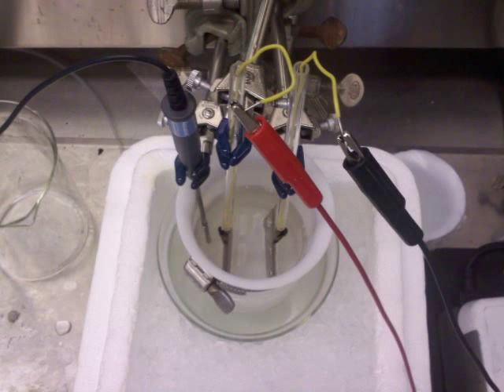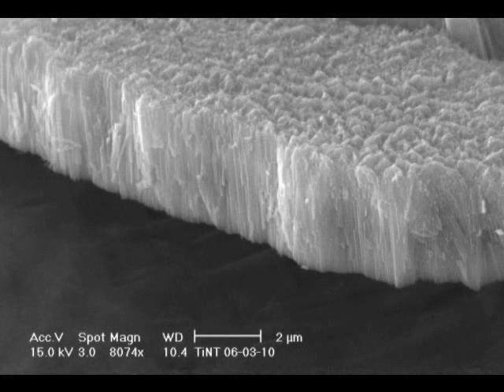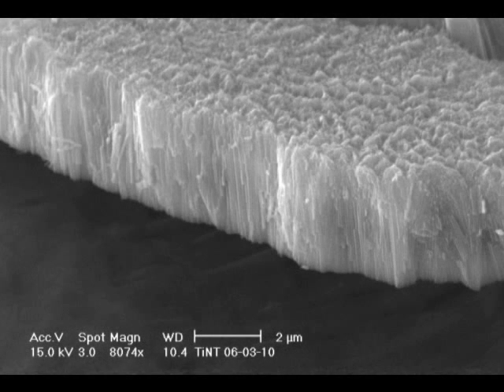The first step in making our anode is a process known as anodization. An electrolyzed solution is used to etch nanotubes into a titanium plate, forming titanium oxide tubes with a width in the range of 40 to 200 nanometers depending on the applied voltage, and roughly 20 to 30 microns in length depending on time.